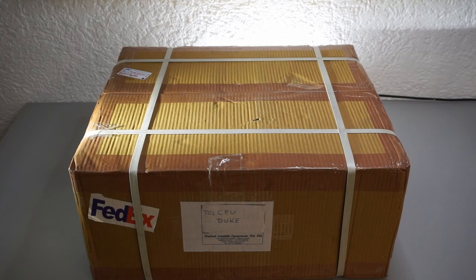Now let's open it up and review this thing, because I have not found any other review on the internet, on YouTube or wherever. So let's have a look inside and give it a try.